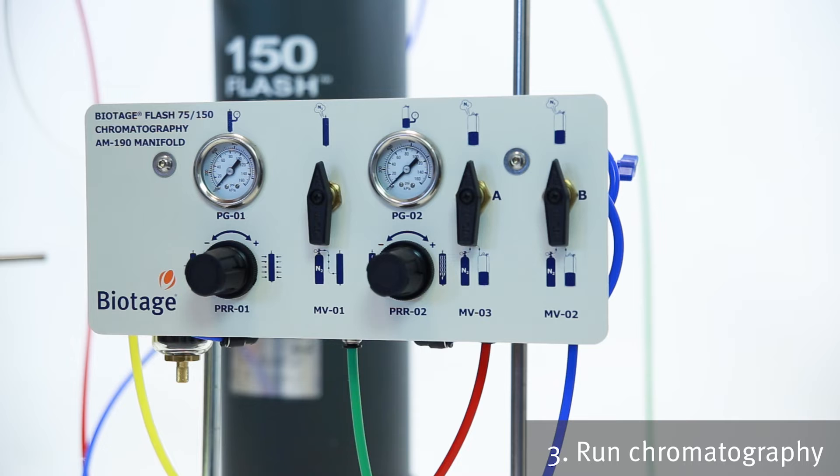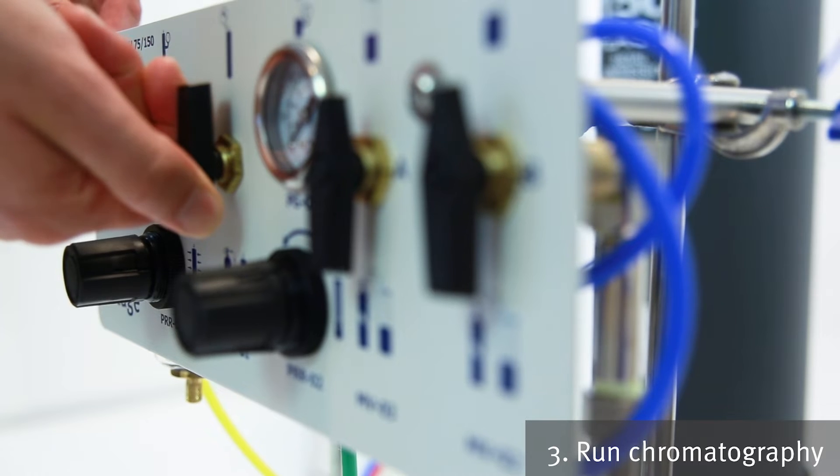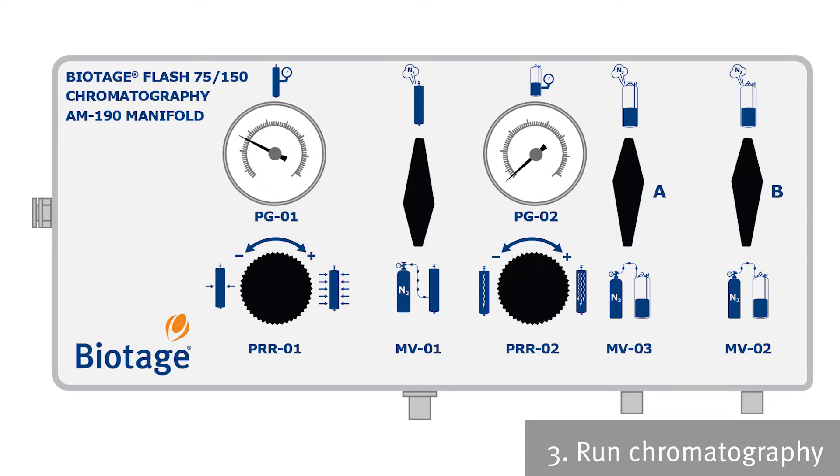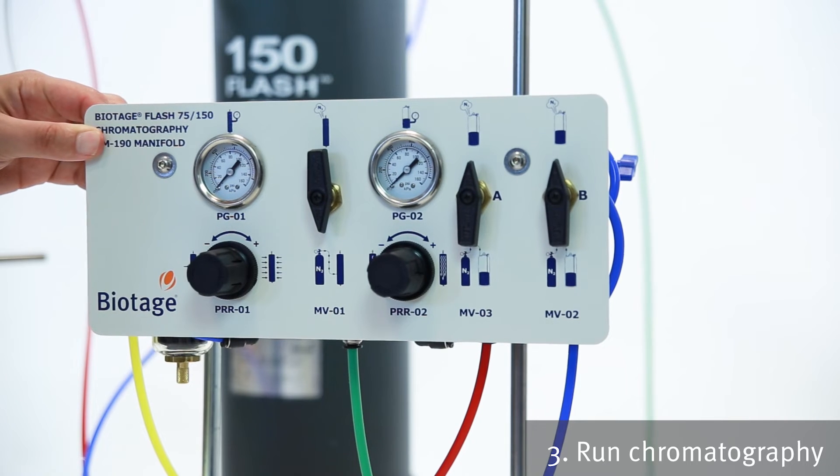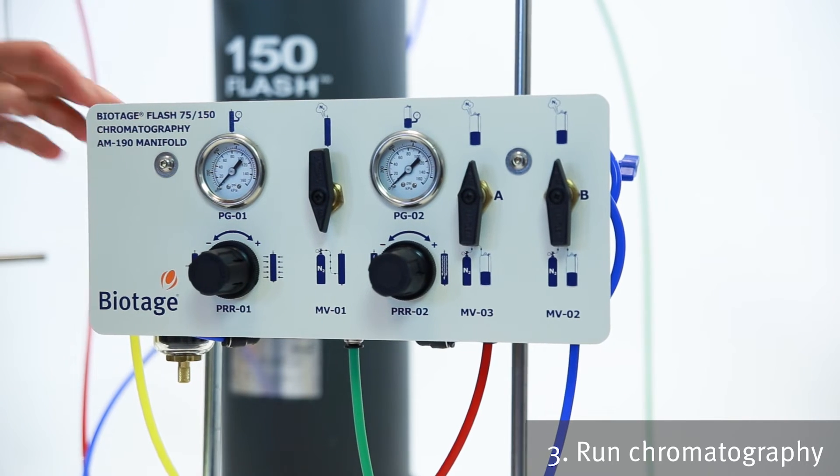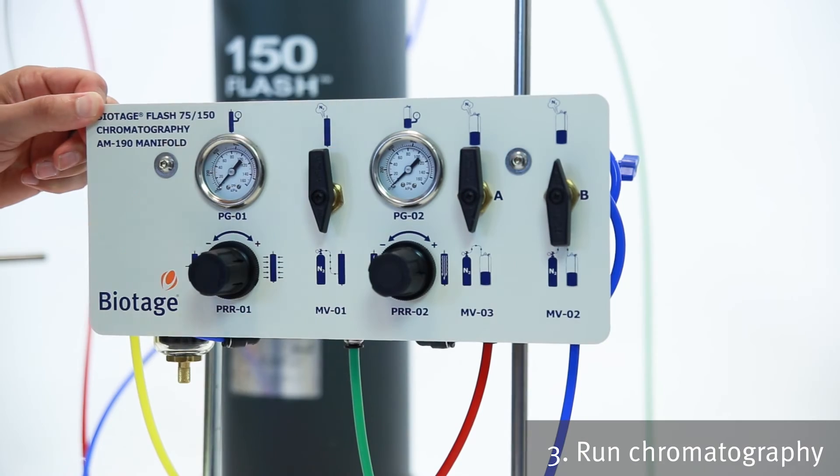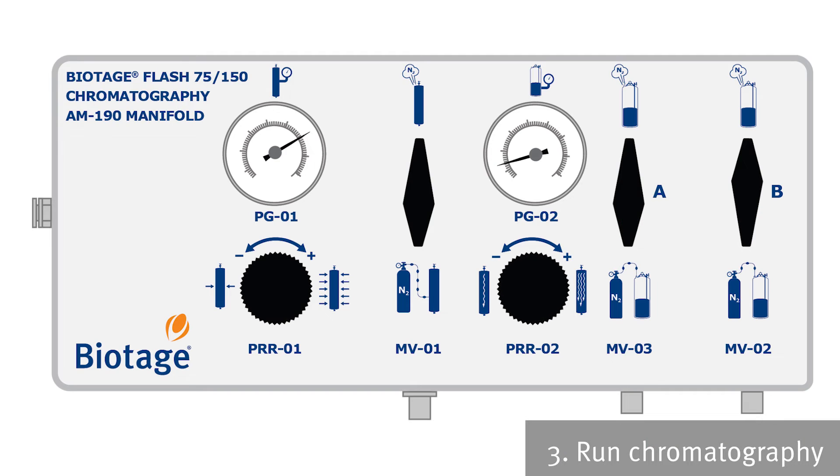So first up, we've got to make sure that the pressure is 100 to 120 psi. And then we're going to make MV-01 live. And then set the pressure that we want to run the system at. This is going to set the pressure for the radial compression module. Next up, we're going to pressurize our solvent tank. We're on solvent position A. So we're going to go live on MV-03. Set the pressure to the tank. We're good to go.